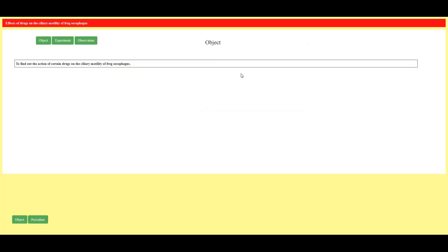On clicking here this screen appears. Let's quickly see the objective of the experiment: to find out the action of certain drugs on the ciliary motility of frog esophagus.